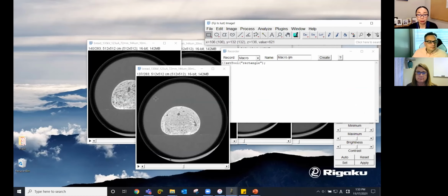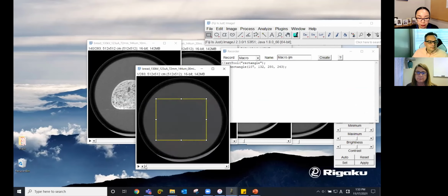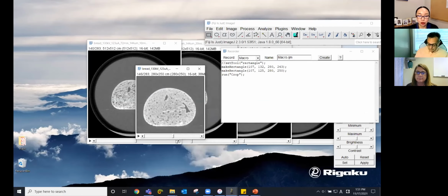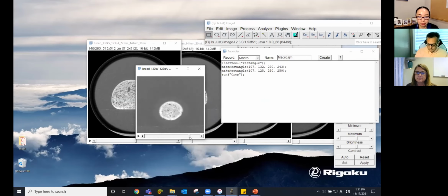I wanted to crop it first. To do this, make sure that the sample is not going to go outside of this range, and the dough is going to rise. So I'm going to have a little bit of slack at the top and do Control-Shift-X. So now this is cropped. Okay.